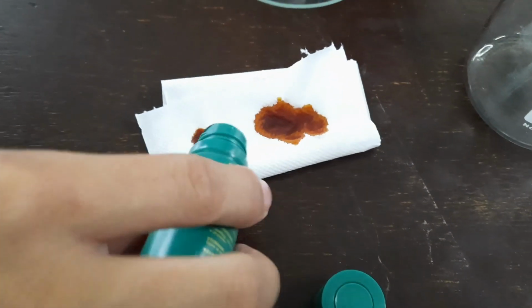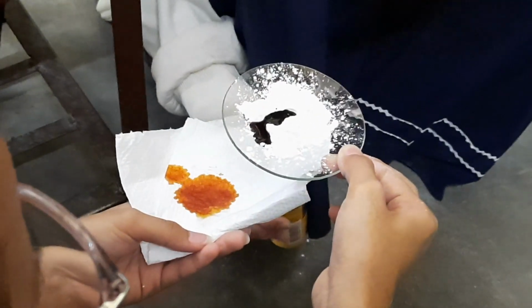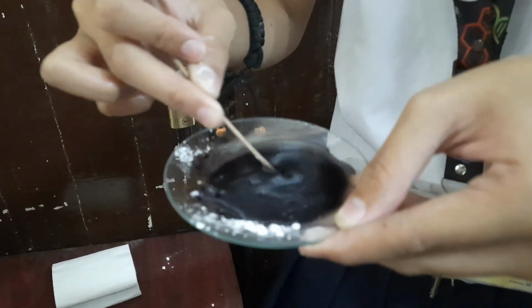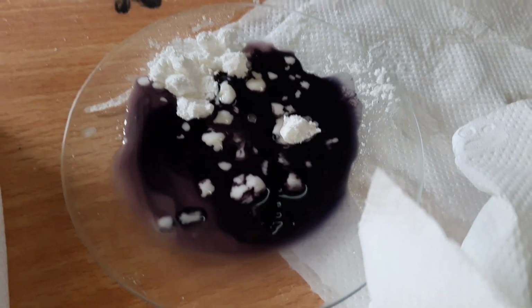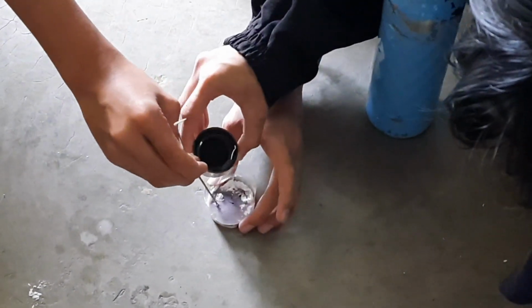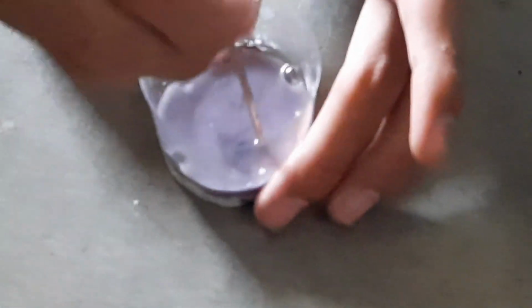For setup D, using an iodine solution, you can test for the presence of starch. When starch is present, the iodine changes from brown to blue-black or purple. On adding the iodine solution to starch, the two react to produce a blue-black color. Add iodine solution to baking soda or cornstarch to introduce the idea that different substances react chemically in characteristic ways. And this is considered a chemical reaction.